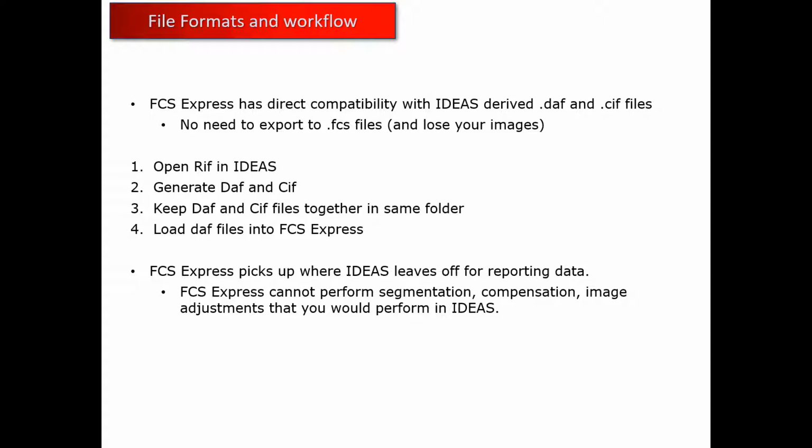If you use the export to FCS file function in Ideas software, you're throwing away all the images that you had put together in Ideas. So, we recommend just pulling in the DAF and CIF files. If you're using other software to analyze the FCS files, keep in mind FCS Express is just going to allow you to load those in.